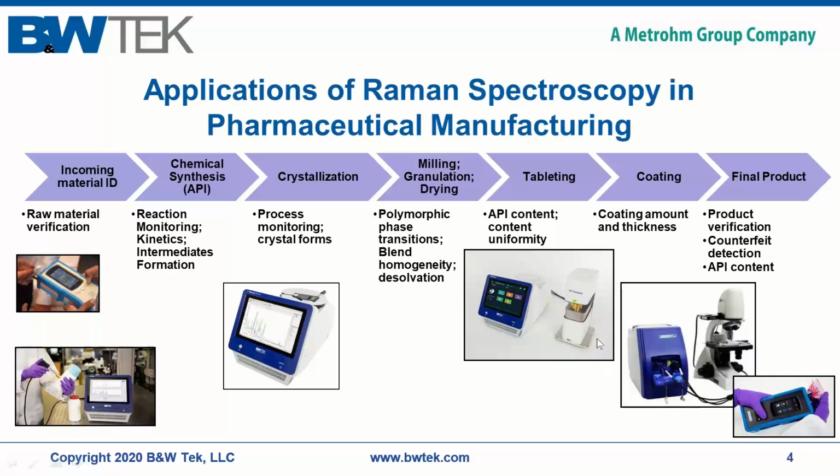Lovely. Just going through to our next question here. Will it be acceptable to the FDA to release the batch? Again, that would depend on your validating your methods and showing that, yes, you have a fully validated methodology.